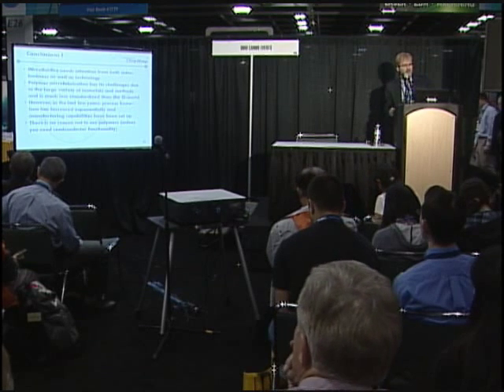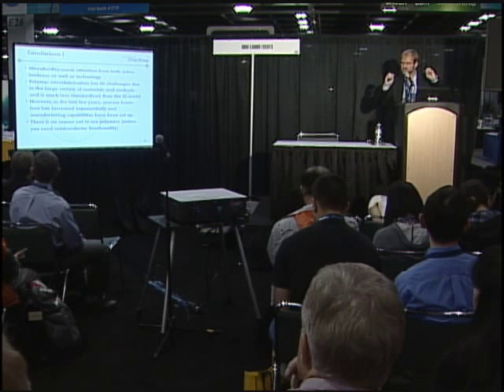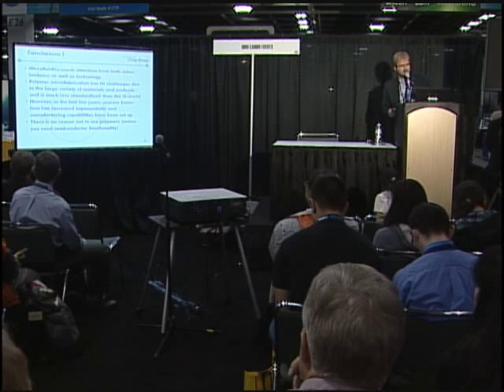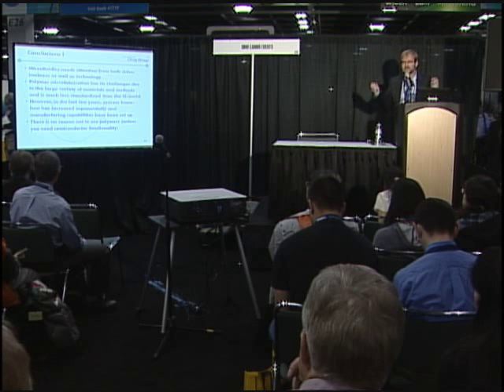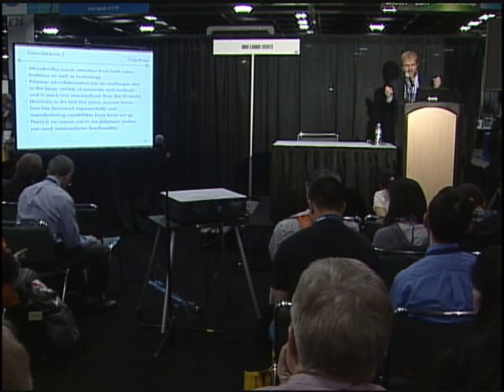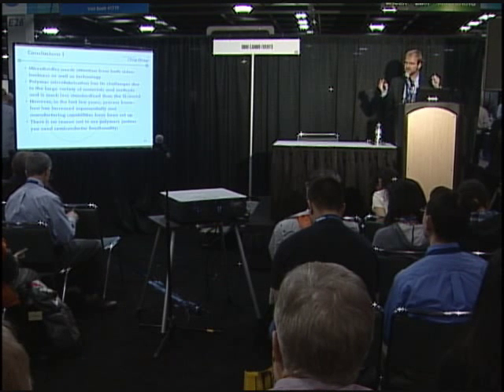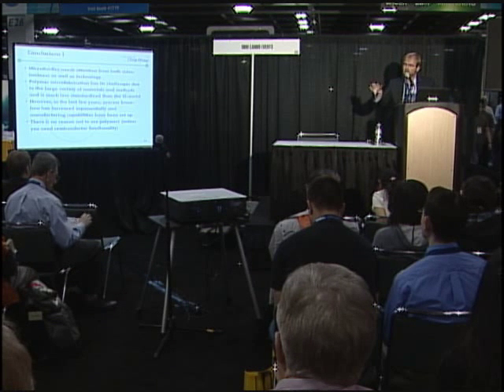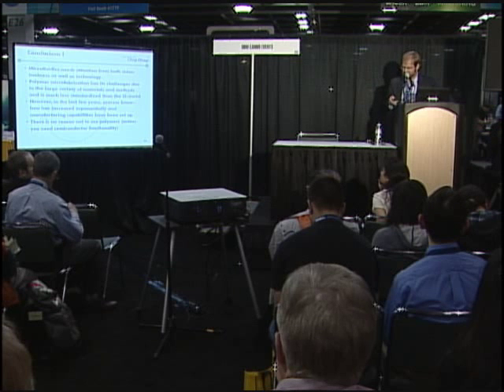Okay, let me conclude. Something which is important, microfluidics really needs attention from both sides, not only the technology, which actually has received a lot of attention, but also from the business side. So as I said, it's easier for us to make 1 million parts than for you to sell 1 million parts. Polymer microfabrication has its challenges due to the large variety of materials and different methods, and it's much less standardized than the silicon world. But in the last few years, process know-how has really increased exponentially, and manufacturing capabilities have been set up. So I don't think that you will not find anyone to make these devices for you. And I always tell people there's no reason not to use polymers as a material unless you need semiconductor functionality. That's the only thing where silicon still makes sense.